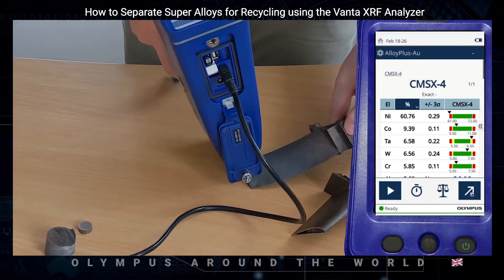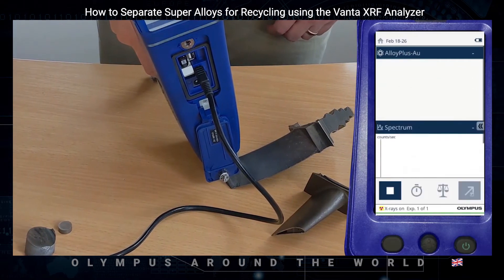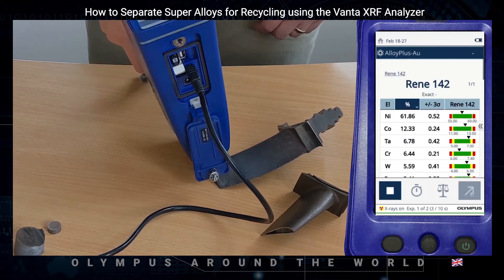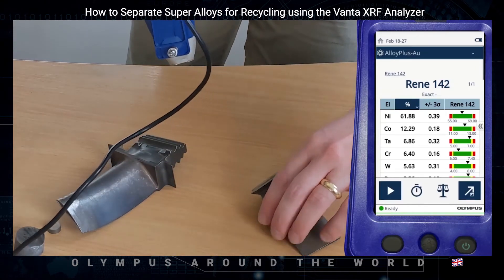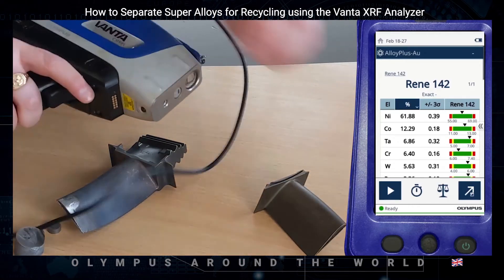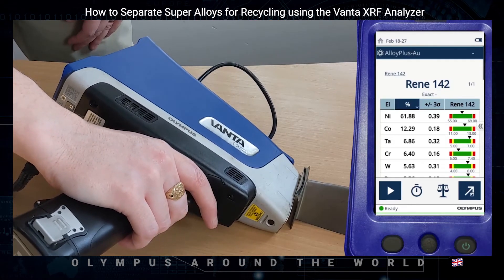This sample — the edge of the turbine blade — is quite difficult to measure. As you can see, in less than five seconds we get the grade match. And sometimes you need to test with a slightly different orientation just to ensure you can get a result.